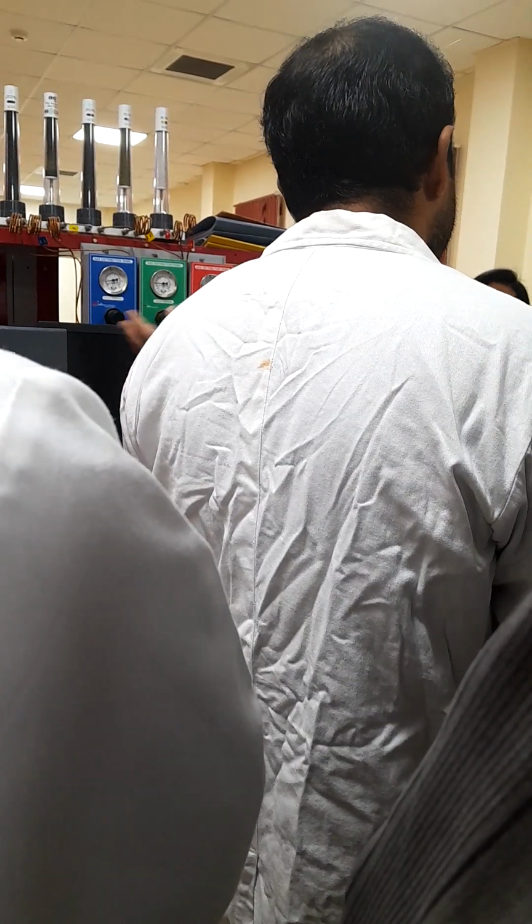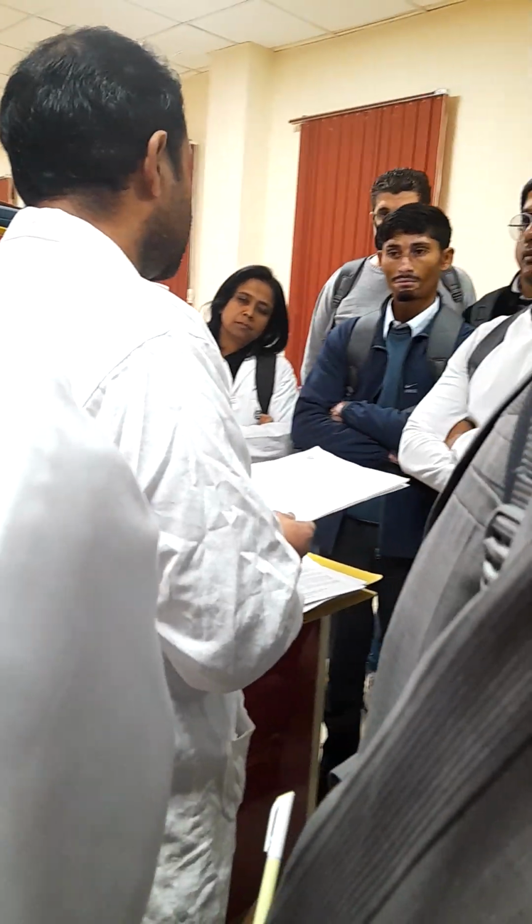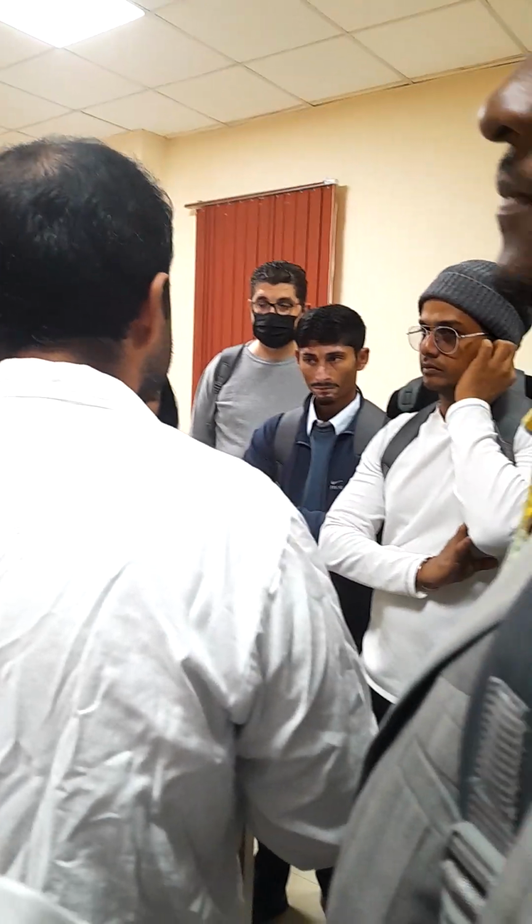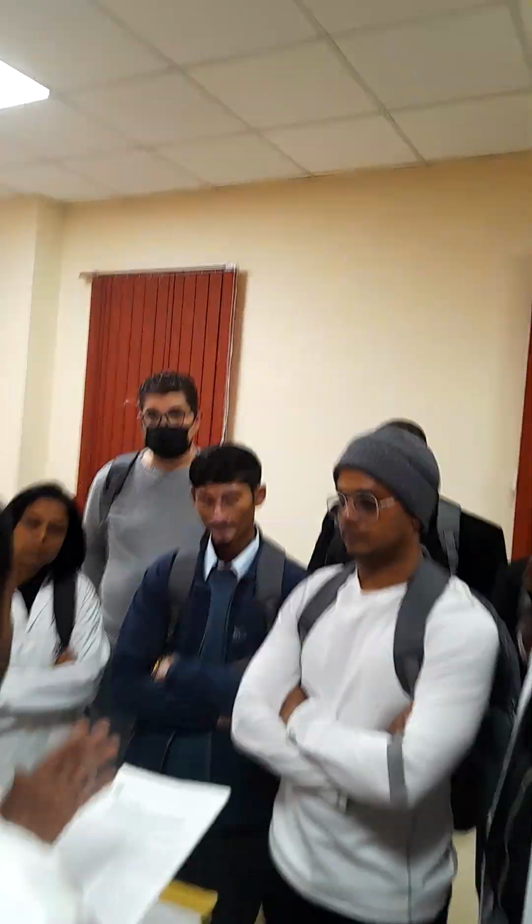If you have a 25 or 30 degree room temperature or inlet temperature, starting temperature, what is the meaning of getting this inlet? It will get lost without entering the inlet point. So you have to provide -20 or -10 degrees Celsius at the inlet point. For that you need a nitrogen provision. But in this instrument we have only from C5 onward. So C5 onward we can get easily.